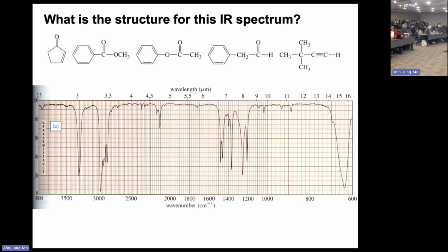This is an IR spectrum. It could be responsible for either of these molecules there. So what we're going to do is match each spectrum with the structure of the entries. Let's find out how we're going to do that. These are the IR spectra given, so you need to start picking out what is a characteristic signal that you can use to solve these things out.